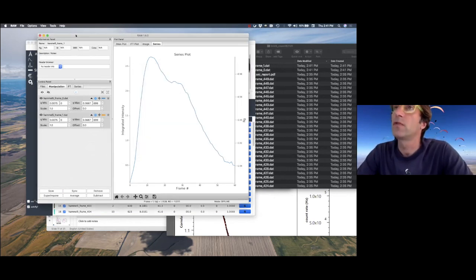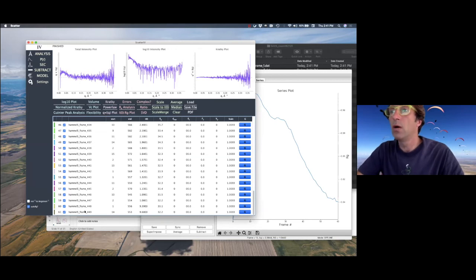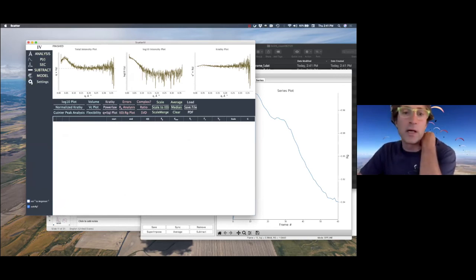I can save it here because I'm really used to working with the scatter much more than with the raw. All that I did here can also be done in RAW, but I really like to make Rambo a little bit more famous than he is right now.